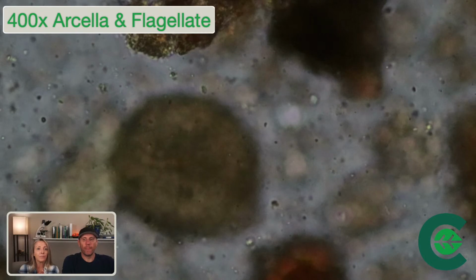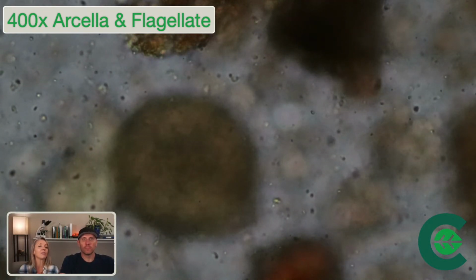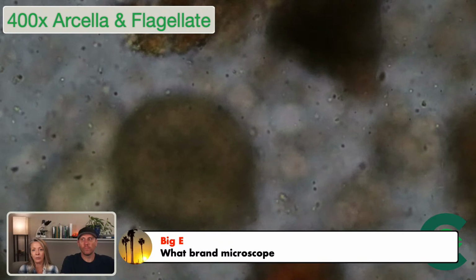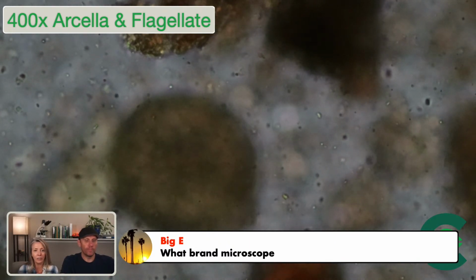Anyway, so these are the beneficials. This tells us that there are aerobic organisms going on in this soil, and we've got a lot of flagellates moving in and out of the field of view here.